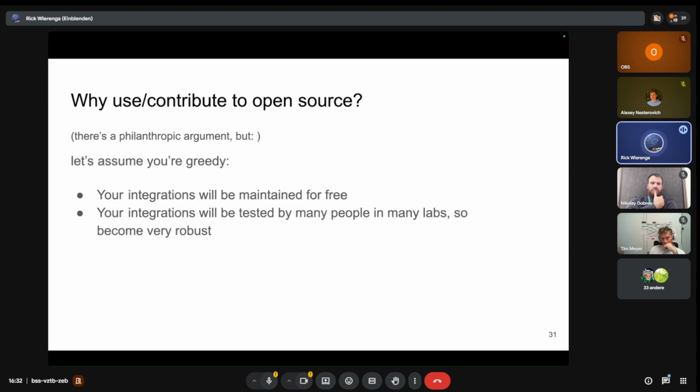And this is very important in lab automation, because we know that every error is very expensive. And so even if you can share the errors among many people, it'll become very cheap for you. If every error occurs once in 1,000 times, you can wait for this to happen to you after 1,000 times of trying, or you can spread this across different people.